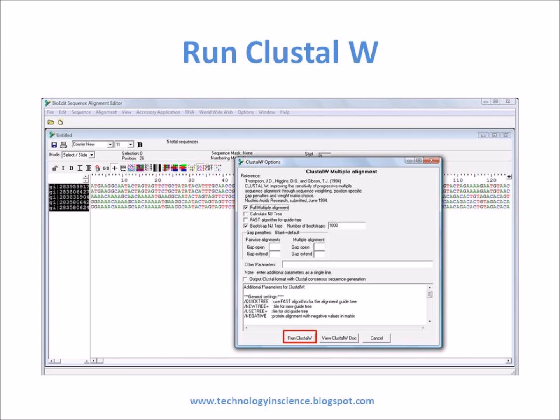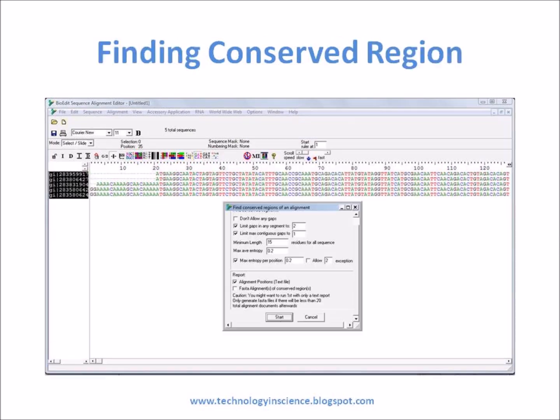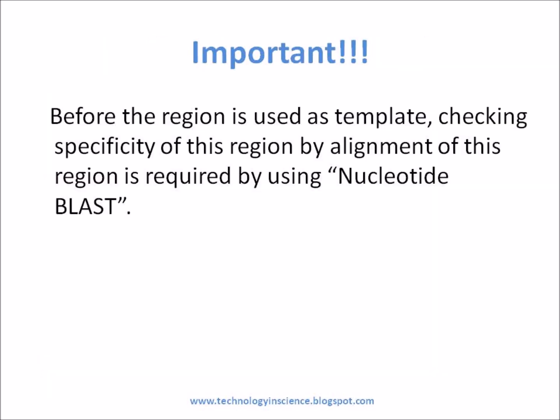Then choose one region as the template. Use the chosen region as a template for real-time PCR primer and probe design. Before the region is used as a template, checking the specificity of this region by alignment is required using nucleotide BLAST.